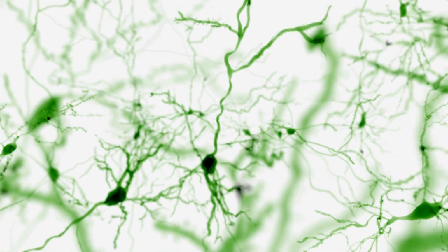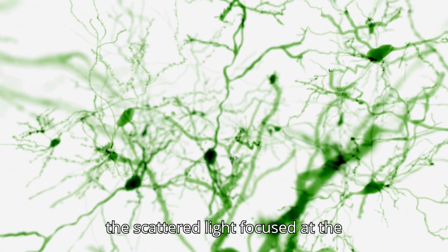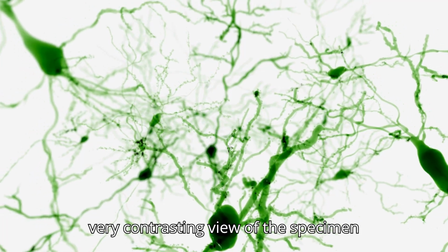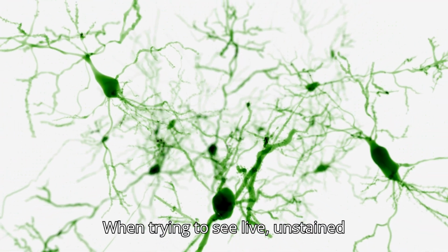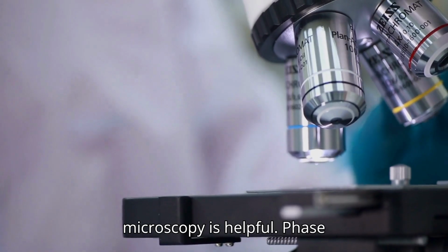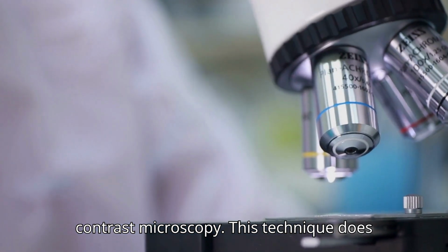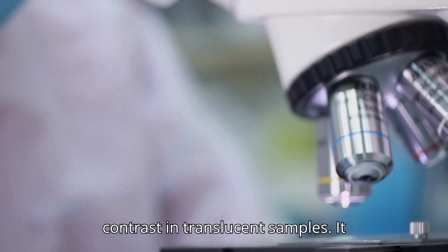2. Dark field microscopy. It collects only the scattered light, focused at the specimen from the sides. It creates a very contrasting view of the specimen against an optically dark background. When trying to see live, unstained samples, particularly those that are hard to spot in natural light, dark field microscopy is helpful. 3. Phase contrast microscopy. This technique does not require staining and increases contrast in translucent samples.